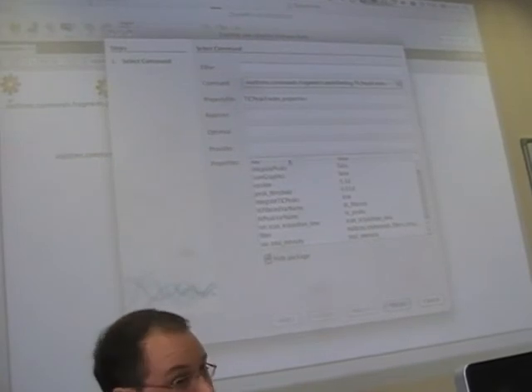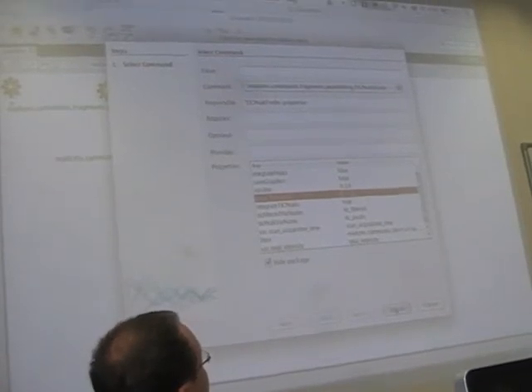For example, I can select the peak finding algorithm, and we use some custom annotations to allow for custom configuration of these commands, and the default values for these are displayed in this small table. You can also set these values here if you like, and then finally add this command to everything else.